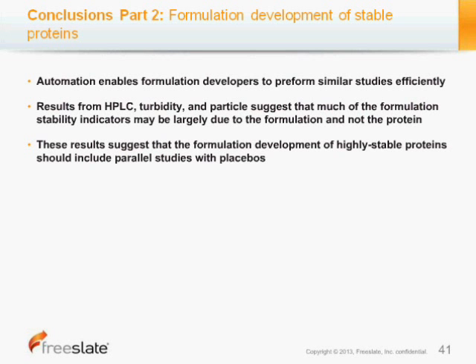And one thing that's interesting in the end here is that these results suggest that with formulation development of highly stable proteins, looking at the placebos in parallel, certainly at certain time points, may be interesting to see where some of these, for instance the turbidity and particles, may be coming from.